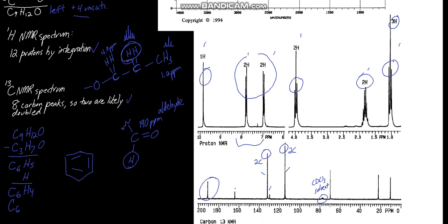Very important point. Okay, so these 2 hydrogens here, there's some symmetry there. It looks like they're doublets and they're equivalent hydrogens. So if you draw out all the possibilities, what you'll find very quickly is that the only way to get 2 hydrogens equivalent to each other across a ring like this is some kind of arrangement like this, where it's a di-substituted ring.